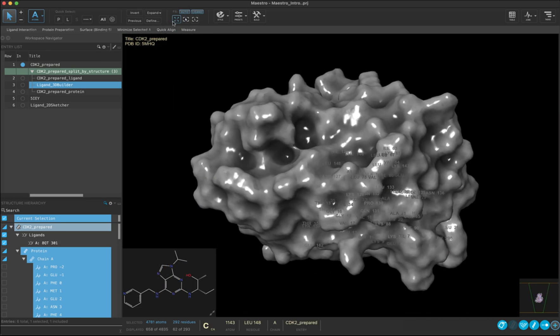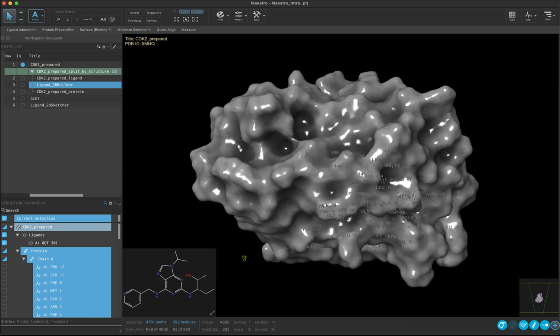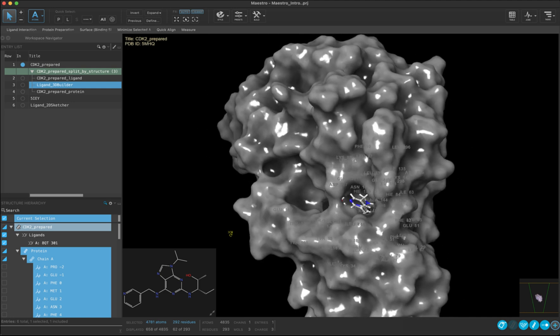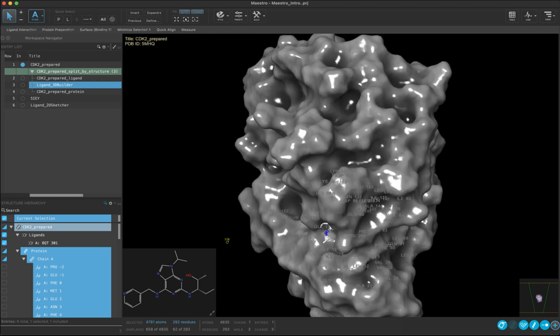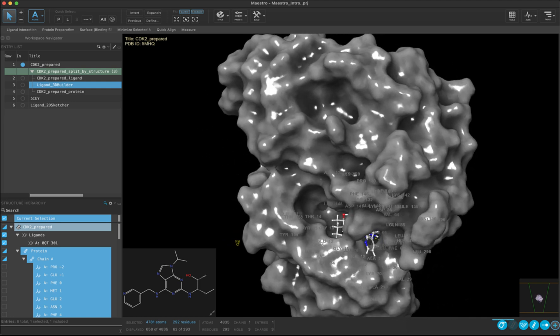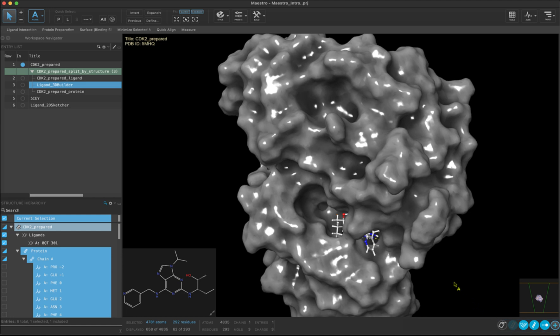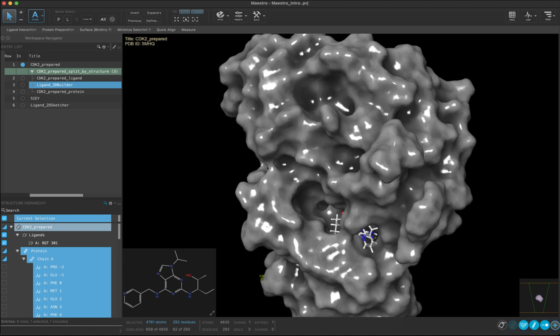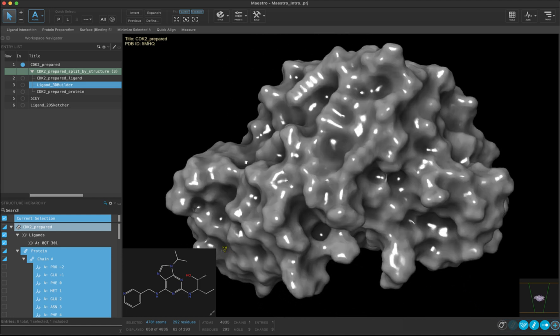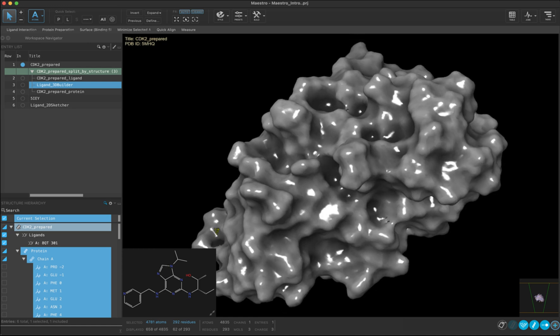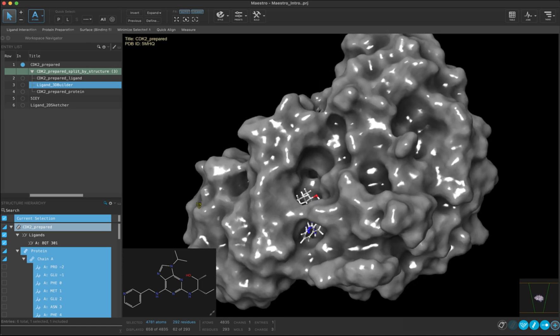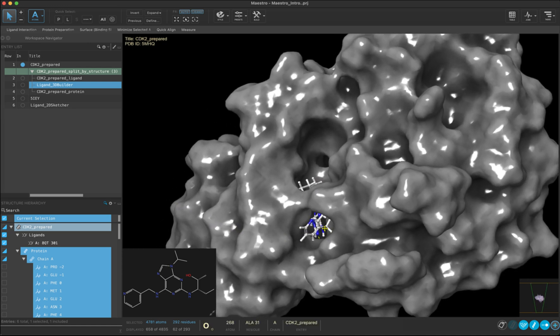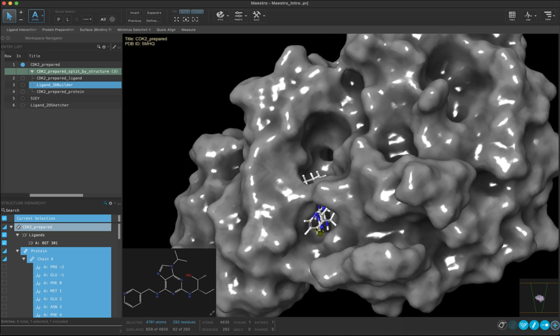This surface view really allows us to see the depth and shape of the binding pocket. Let's toggle off the labels to make it a bit less cluttered. We can also display different properties on the surface, which will allow us to understand even more about the chemical properties of the ligand binding site around our ligand or HIT molecule.